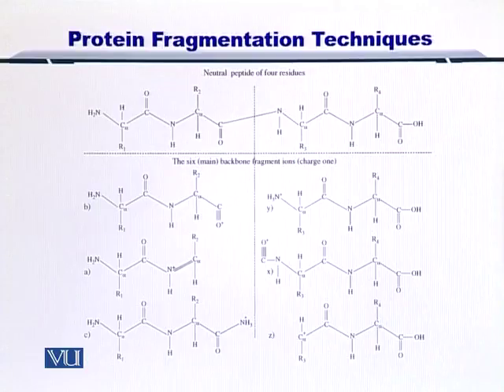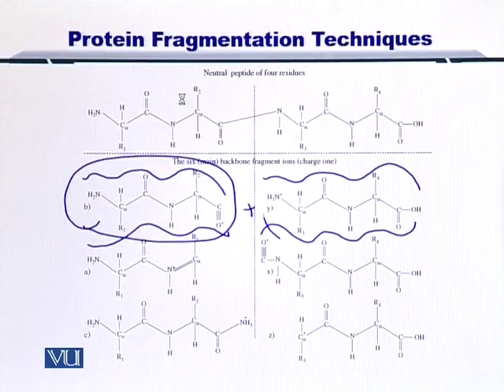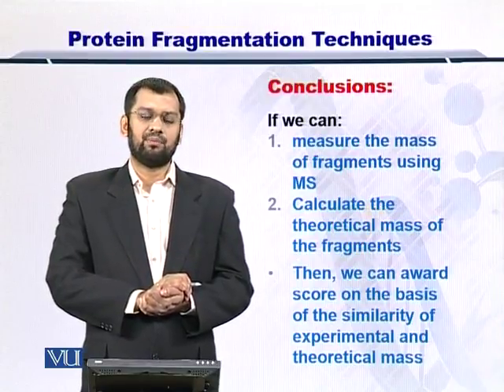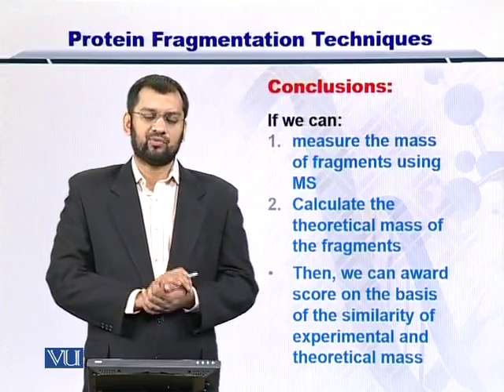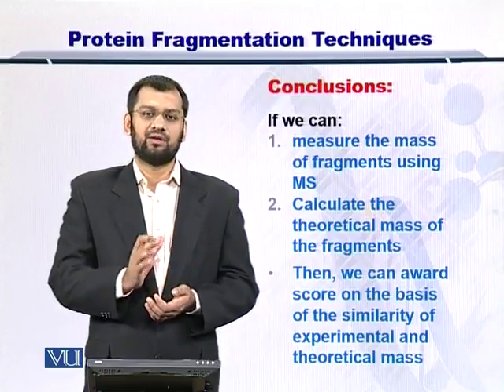You can take a look at them in detail, but briefly, the CID, or collision-induced dissociation, can fragment the protein into 2 fragments, and you can have the molecular weight of this ion and this ion reported as different peaks. So you can use these fragmentation strategies to arrive at the fragments of the precursor molecule, and you can repeat the mass spectrometry procedure to measure the molecular weight of these peptides as well. And similarly, as you did with MS1, you can have a scoring scheme for these fragment matches from the database as well.